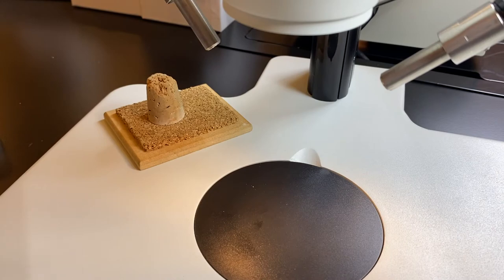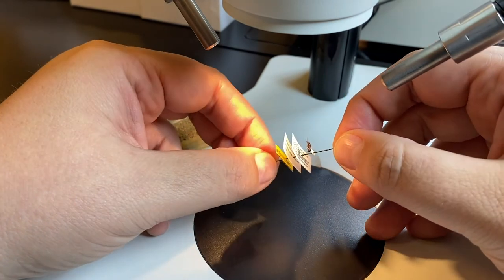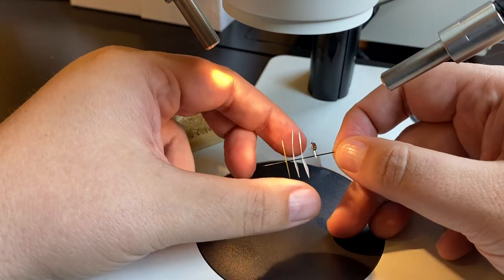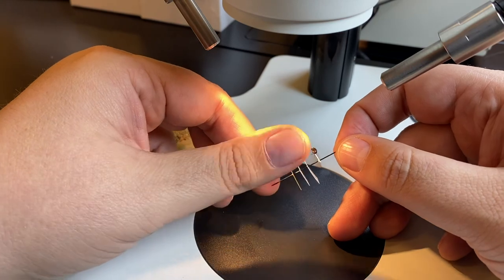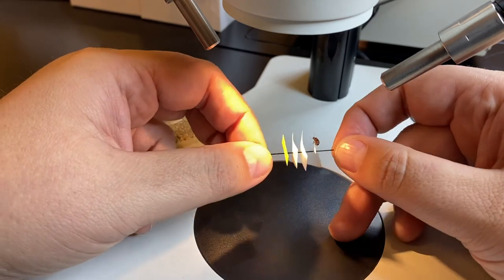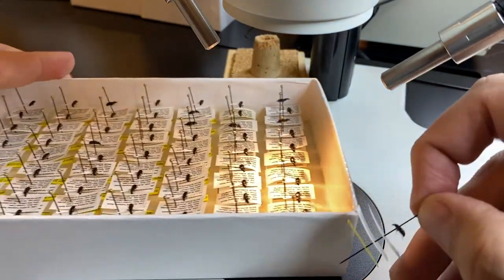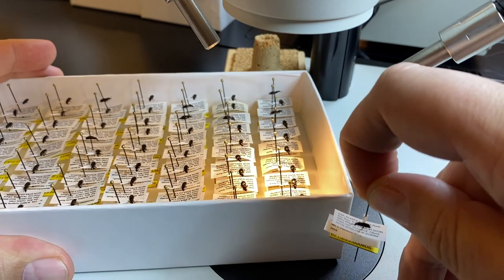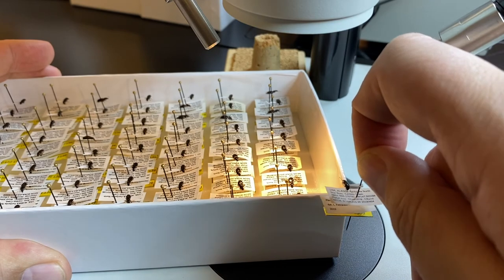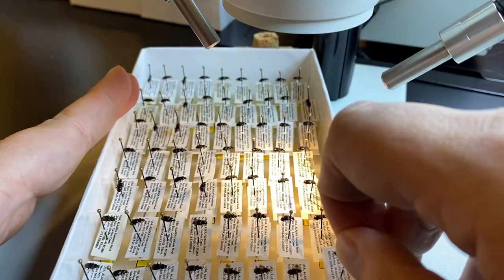Now, if I want to look at a pointed specimen — here we have a smaller specimen pointed above its labels — on these smaller specimens it can be hard to see underneath, so oftentimes you'll have to move the labels. I usually just use my thumb to simply spin the labels out of the way so I can see what I want. Then you can use your finger to rotate them back, or use the side of the unit tray or box to get them rotated and lined back up fairly neatly with the specimen before returning it to the unit tray.